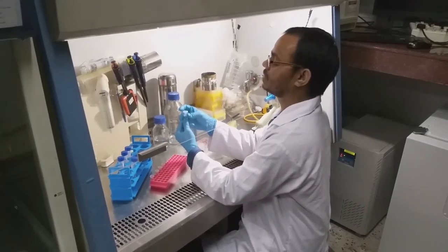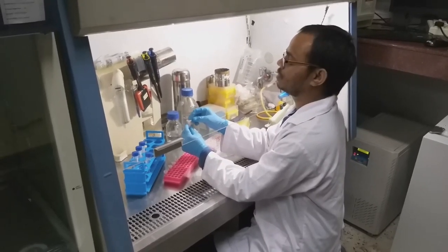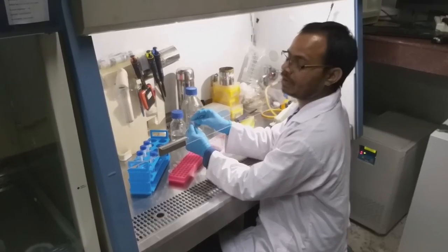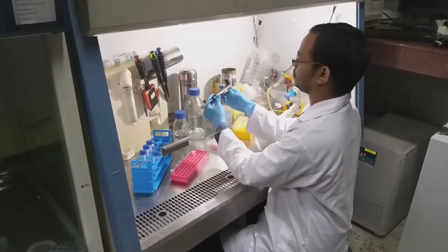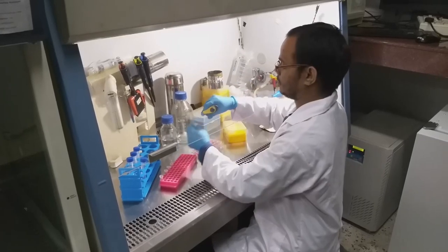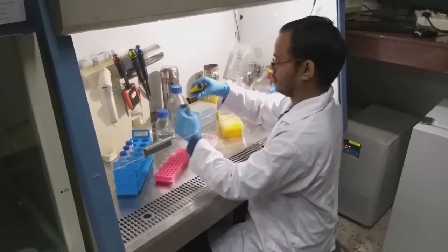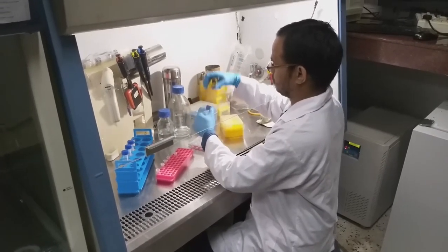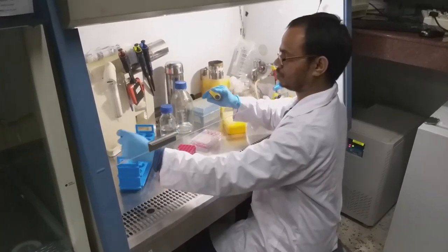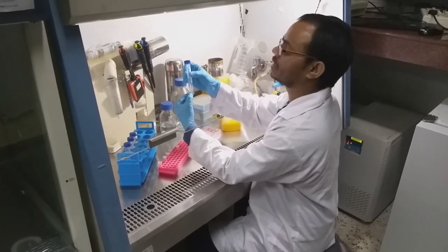This is the PEI transfection reagent, at 1 mg per ml concentration. We added 10 microgram of DNA, so we have to add 1:4, that means 40 microgram of PEI. So I am going to add 40 microliter of PEI. Mix properly. Incubate the tube for at least 5 minutes to get the complex to form.